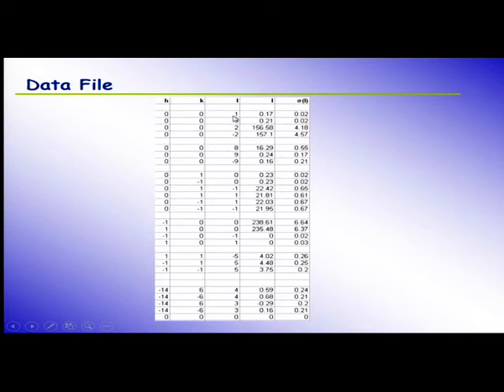These are the Bragg reflections, integers including positive or negative values and also 0. This is the intensity, and the standard deviation of intensities. Automatically this comes from there. Whenever you collect data, with the charge coupled device machines you use, the output will be this. They will be giving this. Even if you do outsourcing, they will give the instruction file and also your reflection file. The end of the reflection list is indicated to the computer by typing 0 0 0 everywhere.